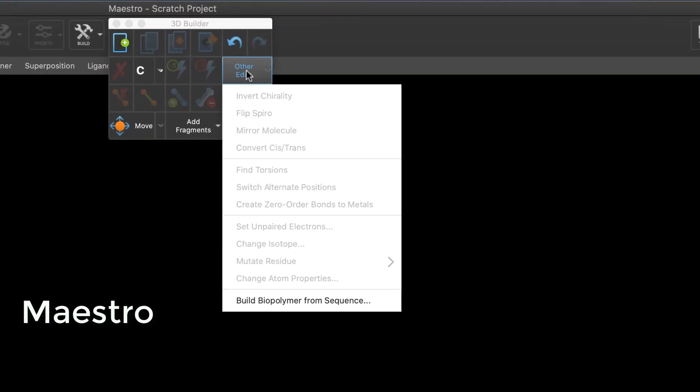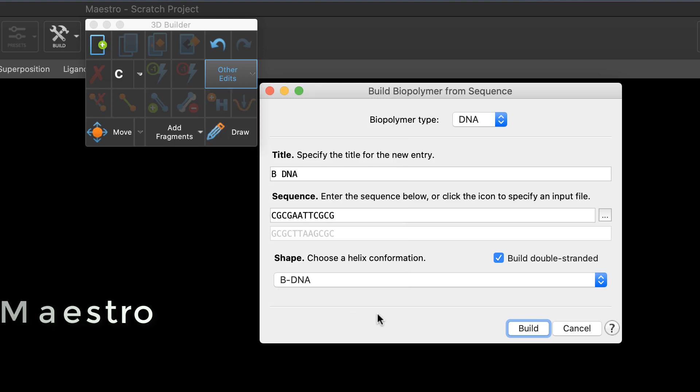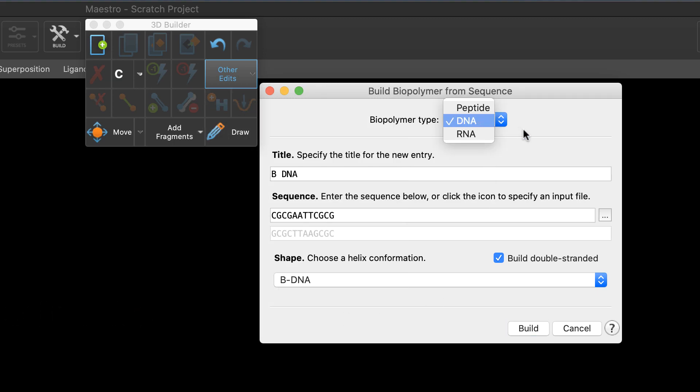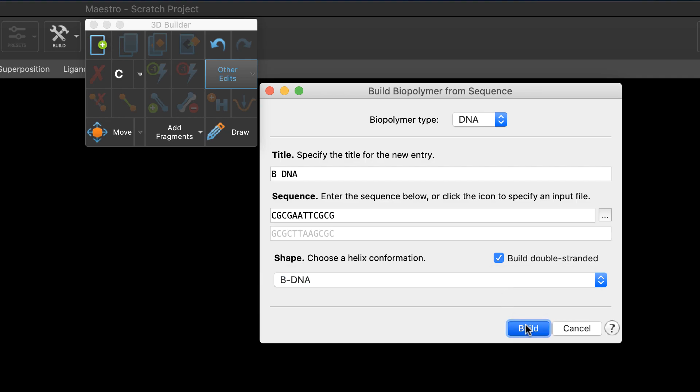Starting in Maestro, users can now build DNA and RNA strands in addition to peptides from a sequence using the build biopolymer from sequence panel. Simply provide an entry title and enter a sequence or load it from file. In the case of DNA, choose whether it's single or double-stranded and B or A DNA helix shape and then click build.